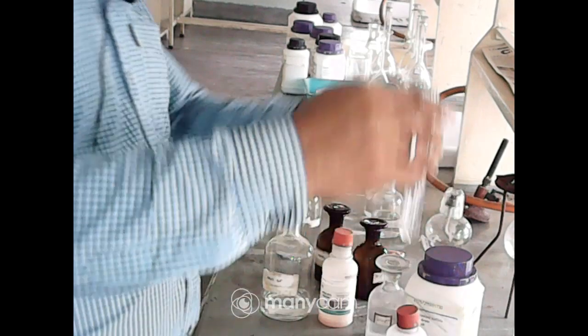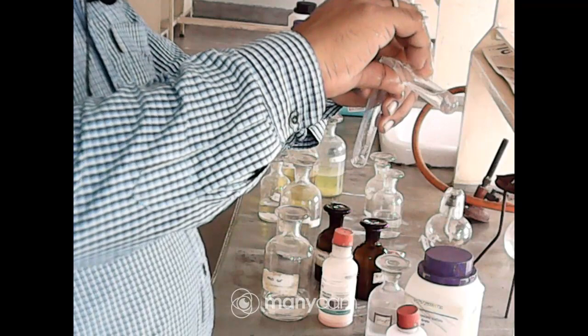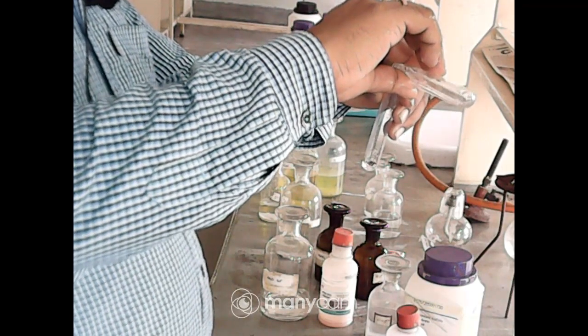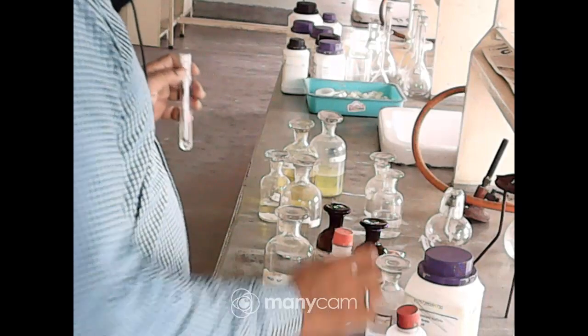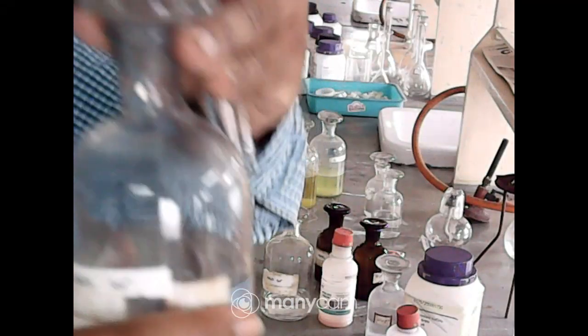Now taking the OS again in a very little amount. Now the reagent for sulfate is barium chloride. I am discussing all these from the confirmative section. So this is barium chloride. This is also a transparent liquid. Barium chloride is available on the rack.